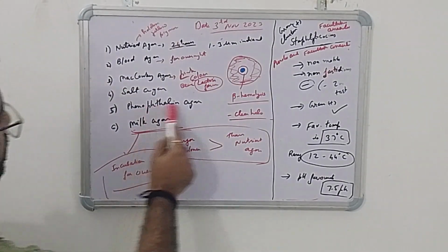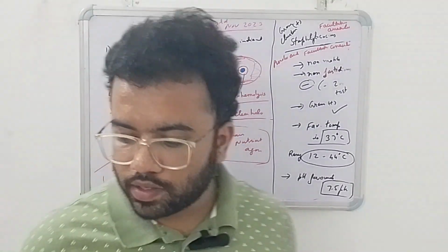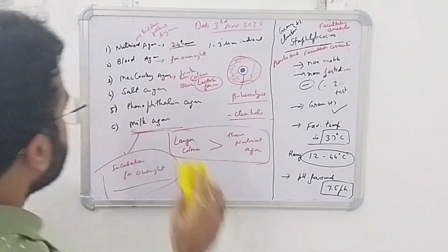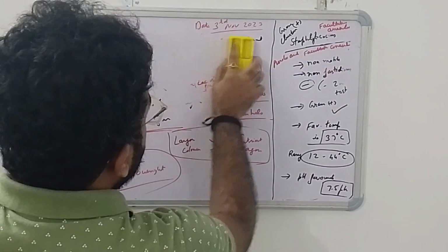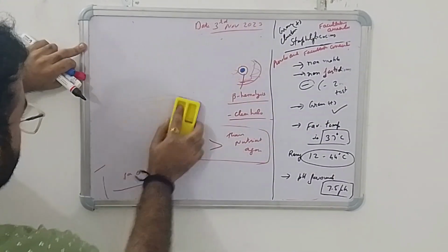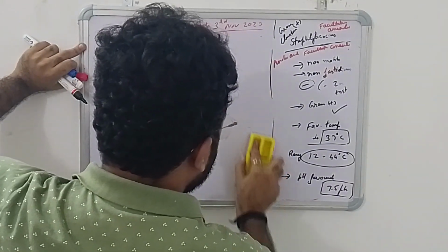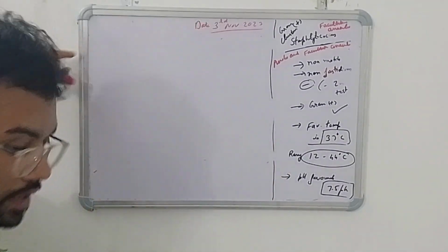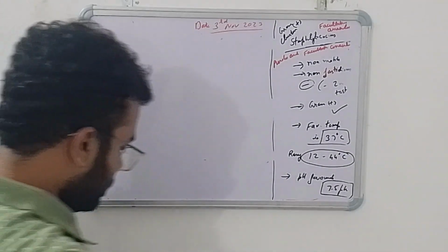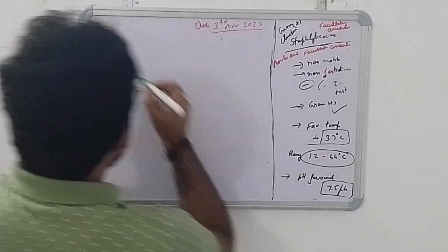And phenolphthalein agar, for that we have to clear all this. We have to give a great concept of the phenolphthalein test. Phenolphthalein. Okay, what is phenolphthalein? The characteristic of phenolphthalein is very important, because it's one of my favorite tests, one of my favorite tests out there.